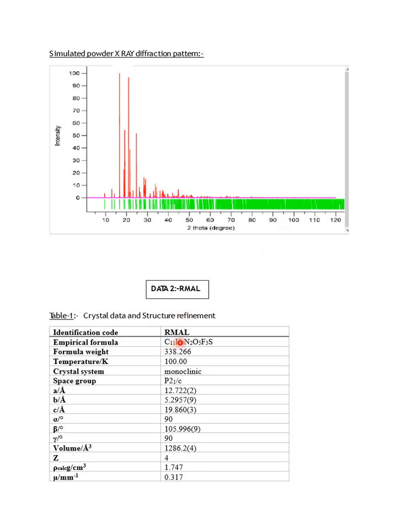Here this is our MAL, and as we can see here the empirical formula for the crystal structure, and we can also see the unit cell parameters a, b, c, alpha, beta, gamma, and this is also a monoclinic crystal system, and the space group is P21/c.